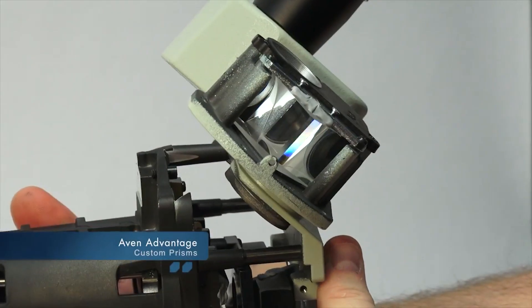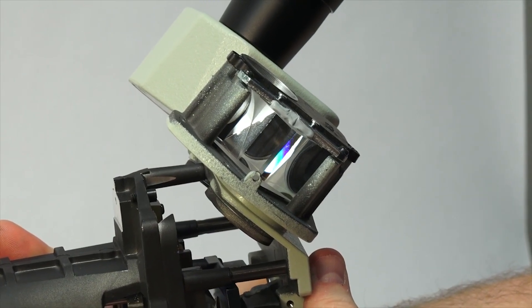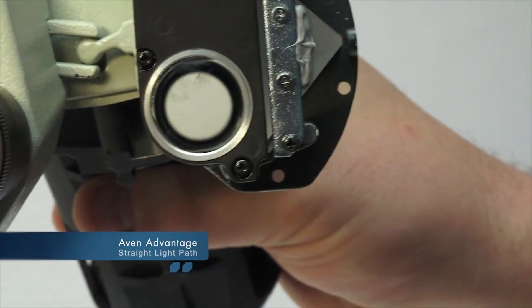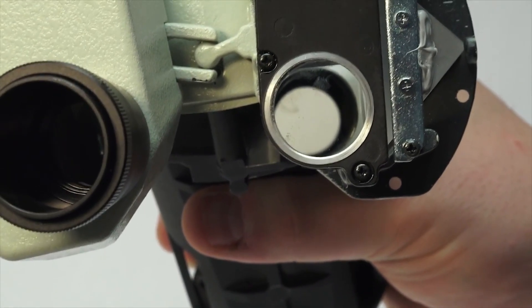Custom prisms: dual prisms are made specifically for Aven scopes and fit snugly into each housing without springs. Straight light path: the dual prism design features a direct light path with one bend to prevent distortion.